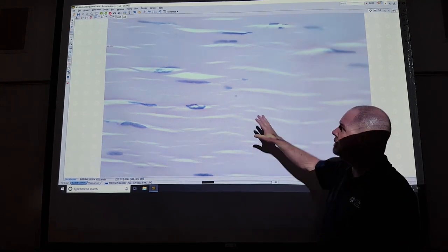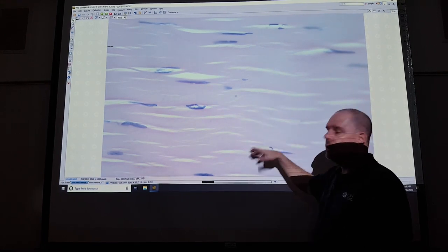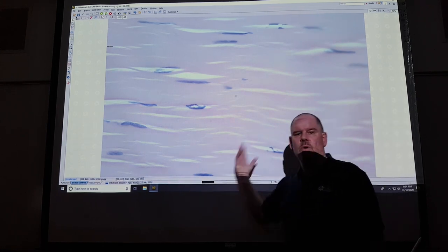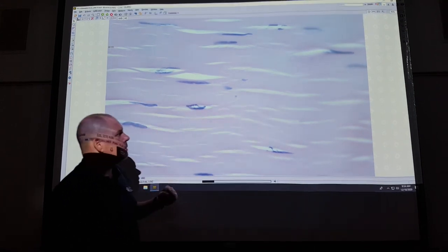So I see these waves in dense regular connective tissue. So name the tissue, dense regular connective tissue. Name the type, connective. Where do I find it? Everybody goes with tendons or ligaments. So tendons and aponeuroses and your ligaments.